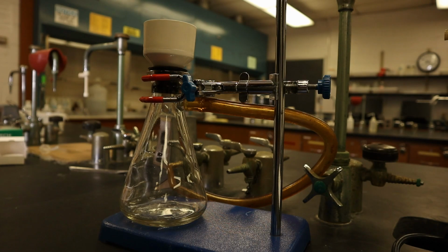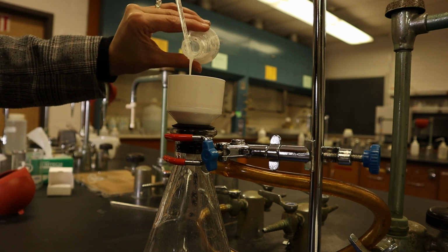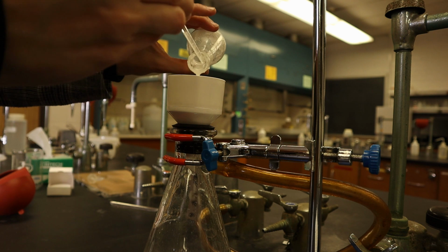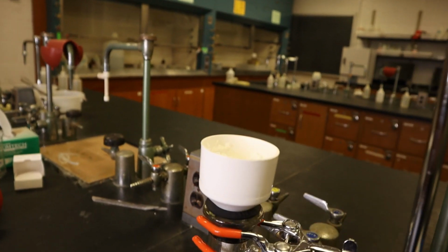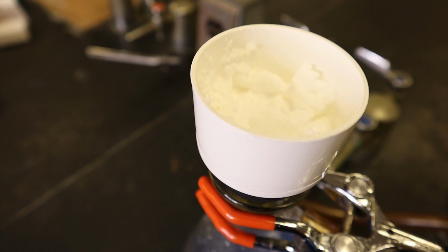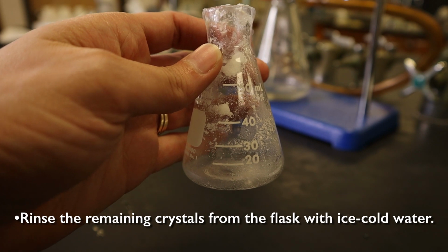Okay, let's get started. Let's take a closer look at our crystals. We still have some crystals left over in here, so I'm going to add some cold water and then I'm going to go ahead and filter it again.